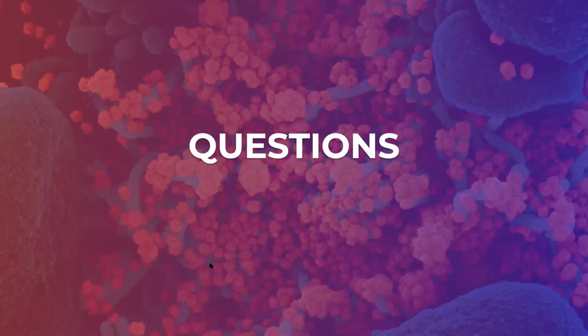Okay, thank you for that question. Yeah, so it's difficult to say what is the best sequencing platform because they have different aspects of quality of the actual sequence, the cost, which is an important factor, so it determines how many sequences we can make, and also how easy it is to work with that data. So basically there, I would say, are 3 or 4 different types of sequencing data that you will find for this kind of application. There's Sanger sequencing, which is the gold standard for long sequencing.